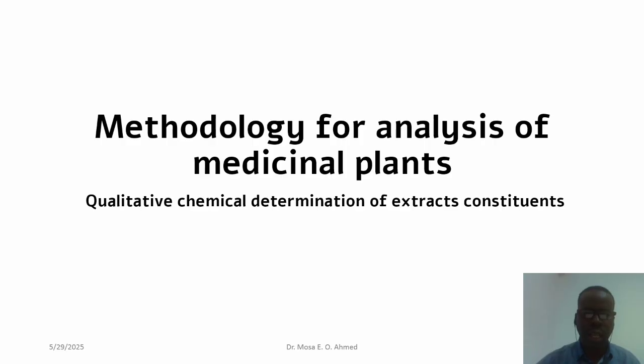And the second class of techniques used for determination of extract constituents is the use of chemical tests. In this lecture, we talk in detail about the chemical tests used in identification of these secondary metabolites.